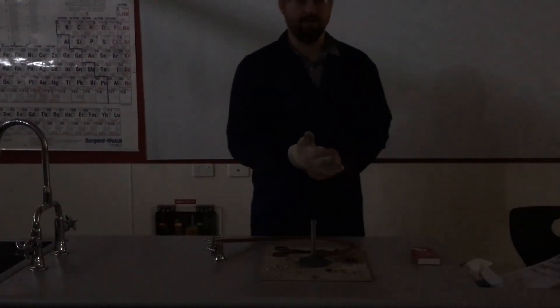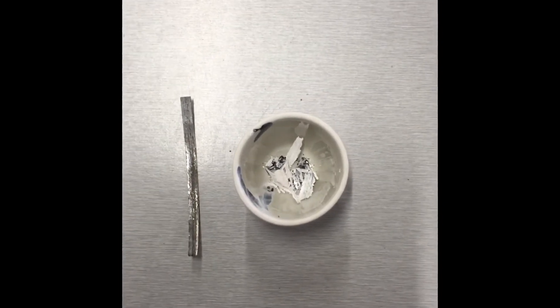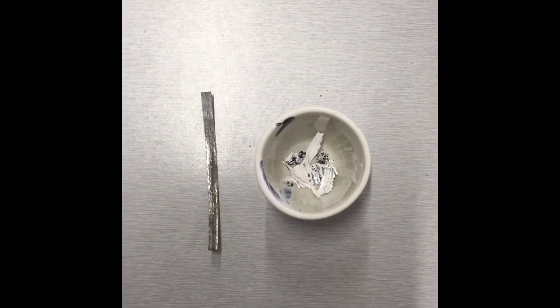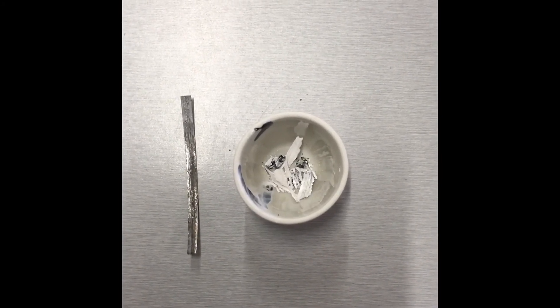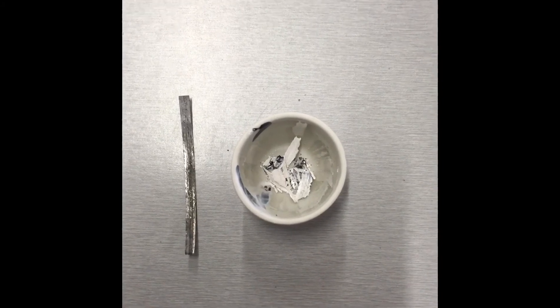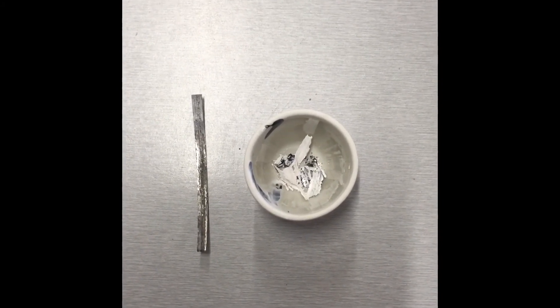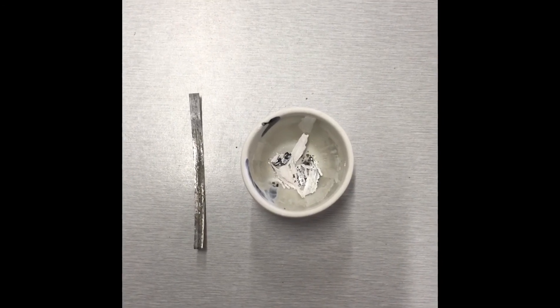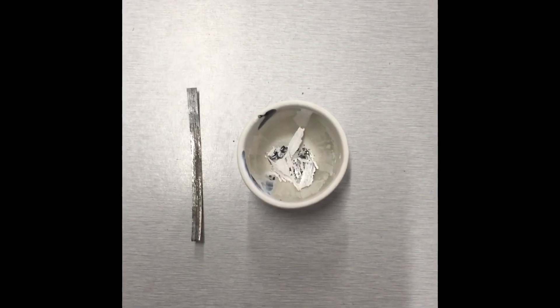Okay, that is the burning of magnesium ribbon. So here's what we have left — I've collected the remaining unburned magnesium ribbon and put it in a crucible, with an actual unburnt piece next to it for comparison. All of that powdery ash inside the crucible is magnesium oxide.